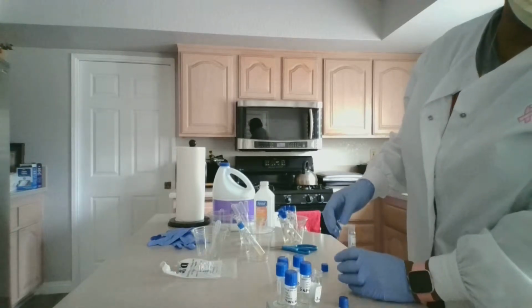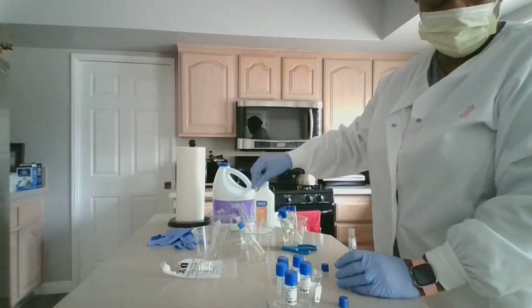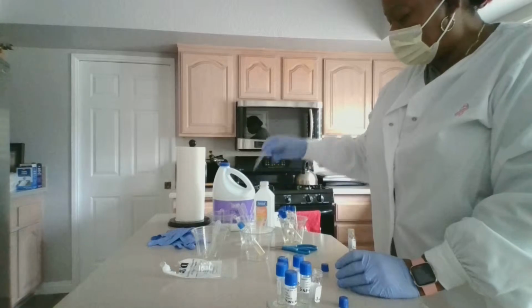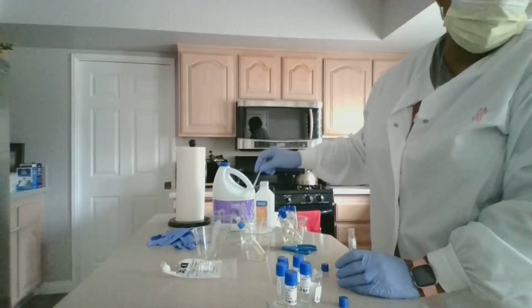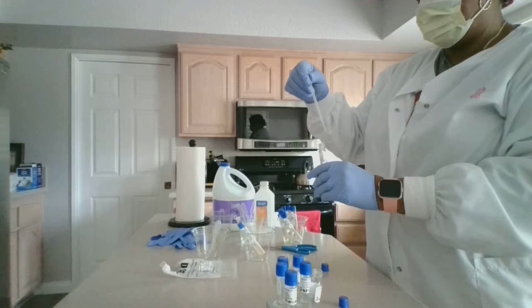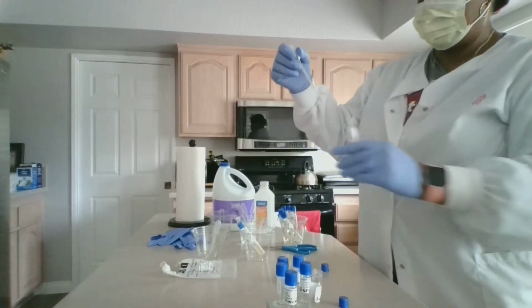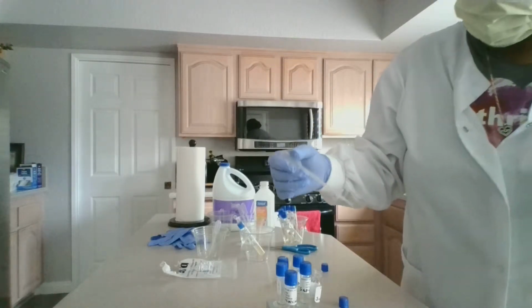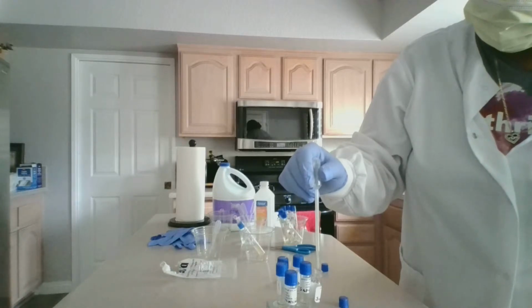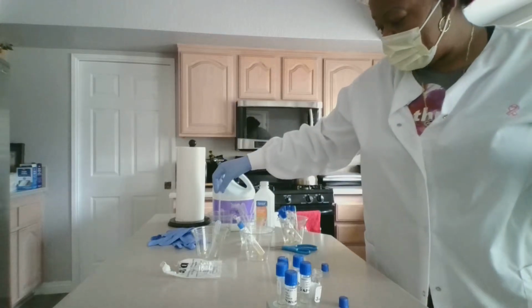And then I'm going to go ahead and remove one of my pipettes from the alcohol, and I'm going to shake it dry. I'm going to remove 2 drops and place 2 drops into the tube. And then I'm going to put this pipette into my bleach, my undiluted bleach.